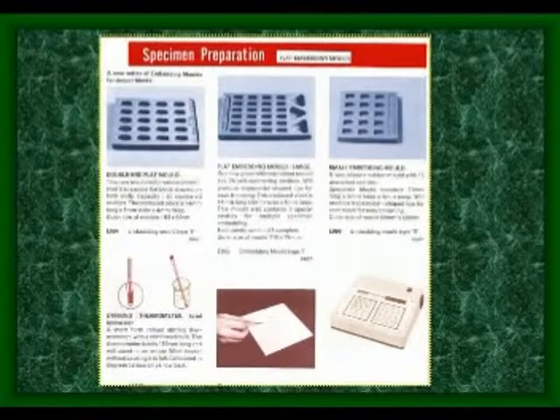Before going to embedding, the prepared resins should be thoroughly mixed without any air bubbles. If a trace amount of air bubbles is there, you will not be able to get a proper block. So to avoid air bubbles, the resin should be thoroughly mixed for at least 6 hours with the help of a magnetic stirrer. After thorough mixing, the resins should be kept covered with black paper for further use. So this infiltration process is over, then you can go for the embedding.